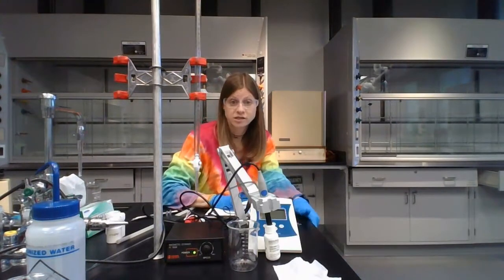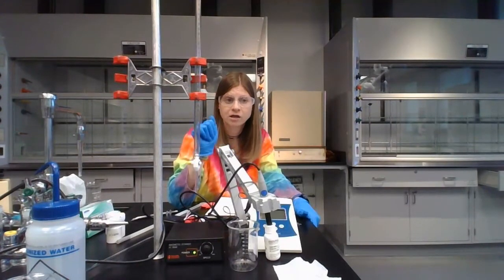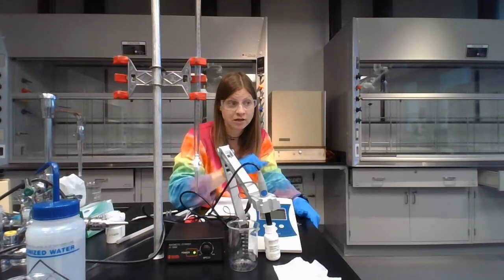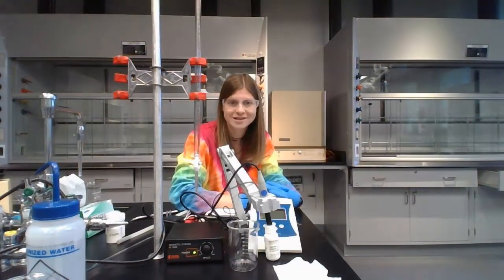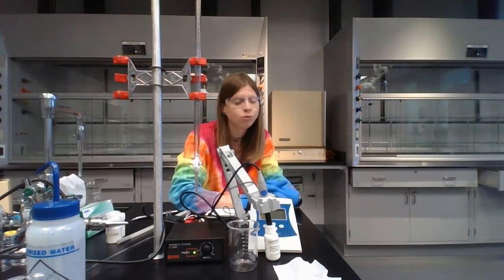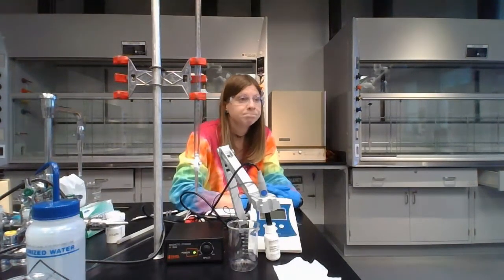Now, all your solutions at this point, you're going to have whatever acid you had from conditioning your pipette, your solution from trial 1, trial 2, trial 3, and any extra sodium hydroxide that you had. That all needs to be neutralized before it gets poured down the drain. There is no waste container for this lab, but those solutions cannot just go down the drain on their own.